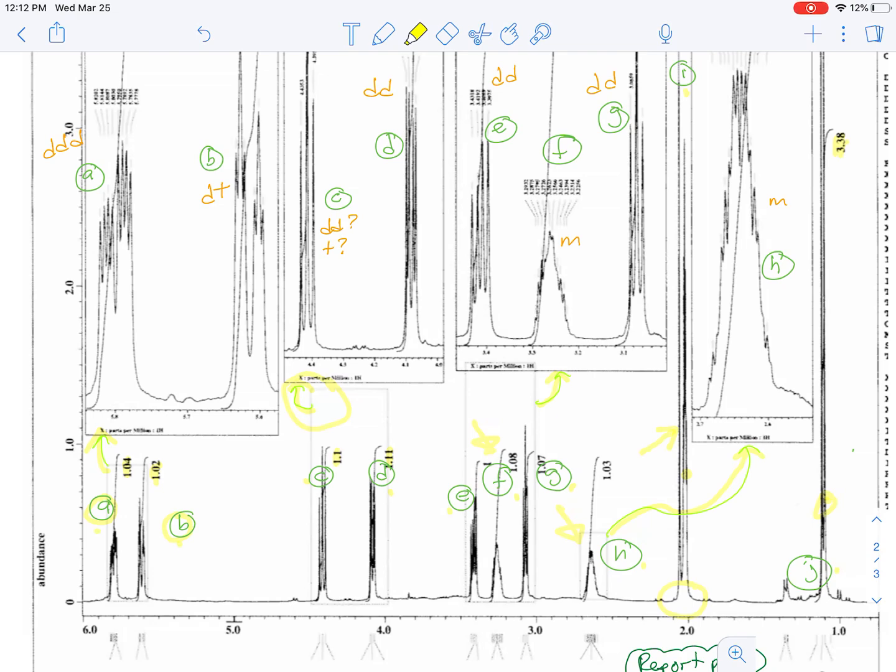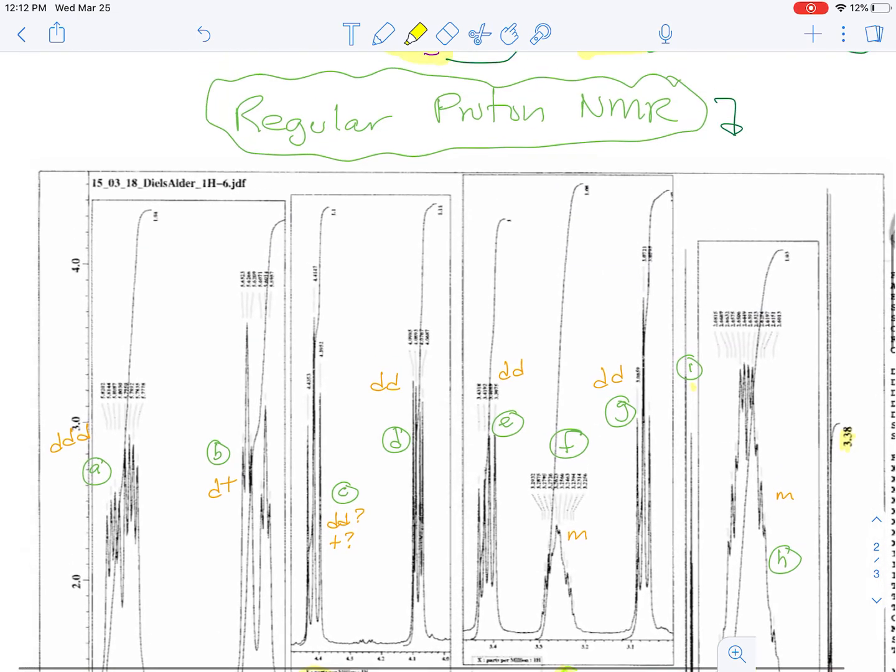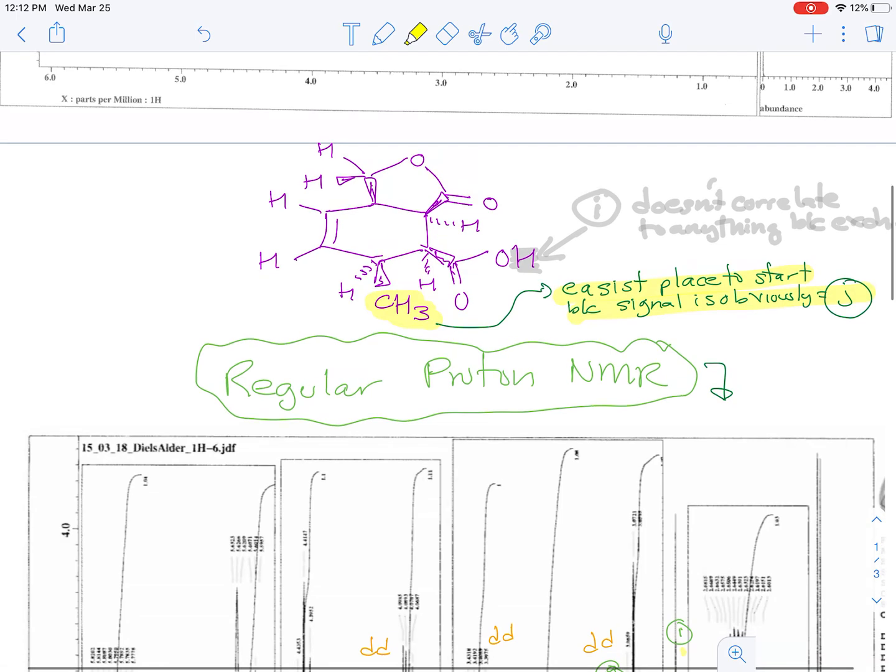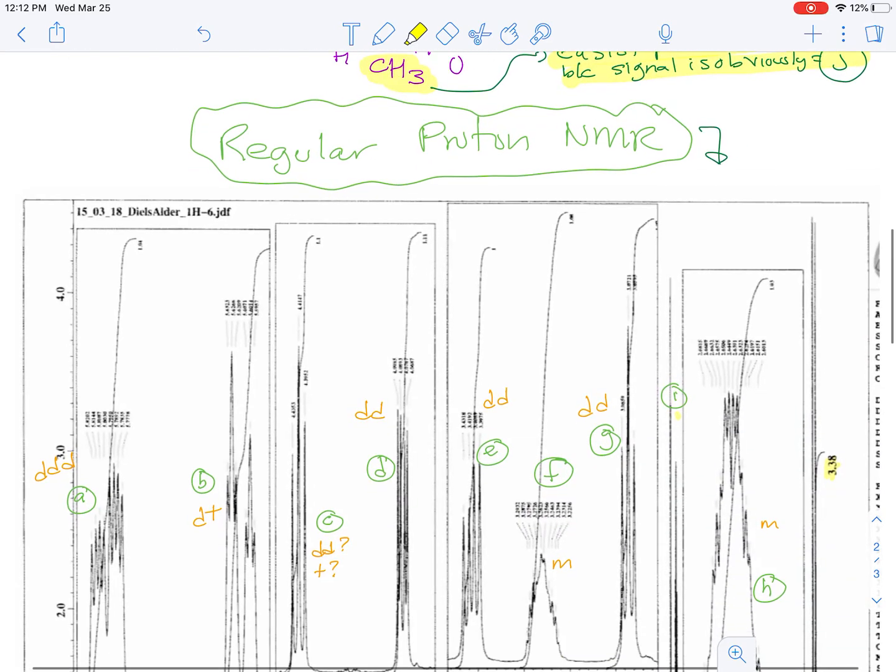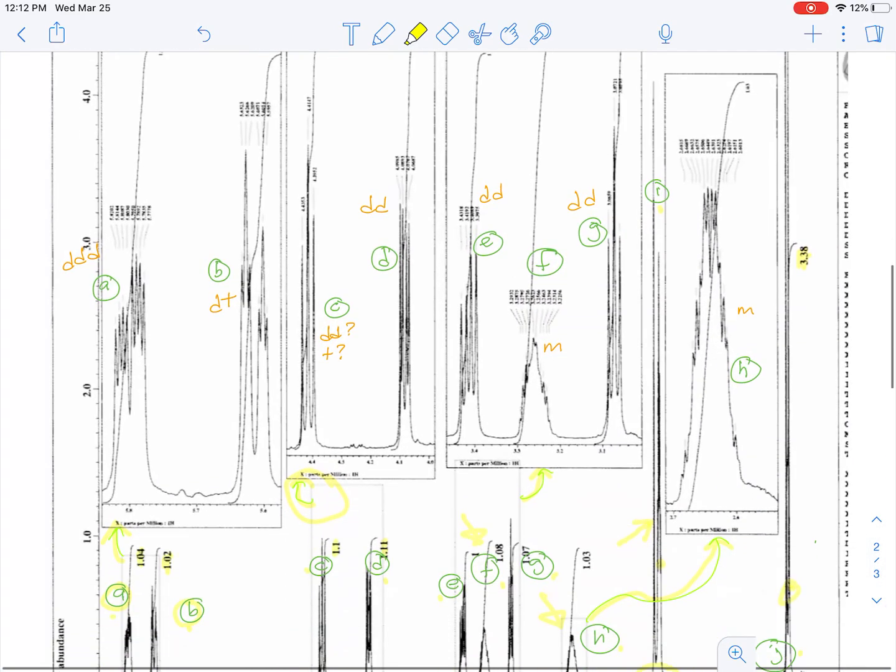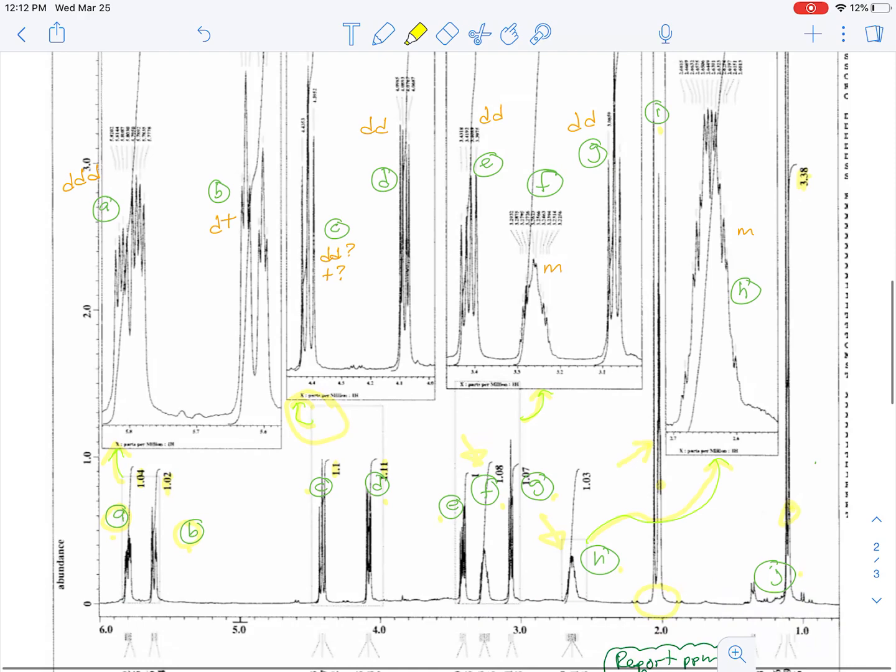Same thing with C and D. We know because of the chemical shift being between four and 4.5 that those are going to be these hydrogens that are on the carbon that's attached to the oxygen of an ester. They're pretty far downfield as a result, also because of their proximity to the carbon-carbon double bond. But again, we don't know which is which.